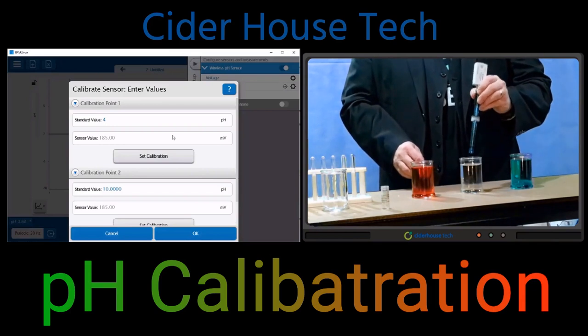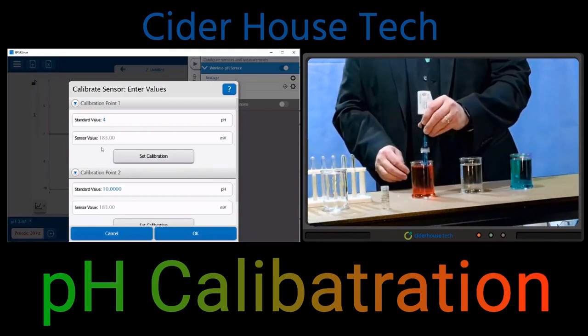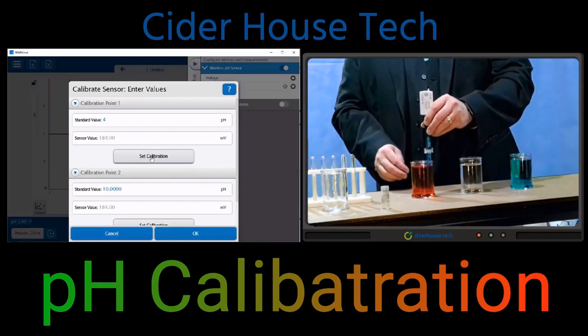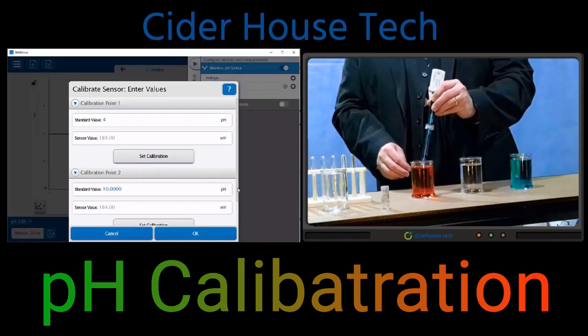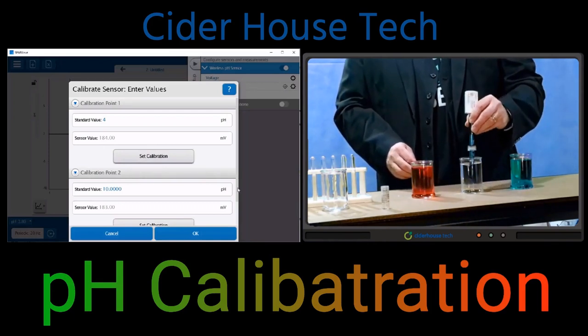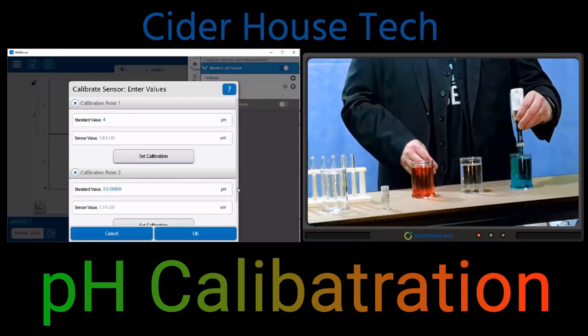Once it is immersed in the solution, I wait for it to stabilize. It looks like it's done that pretty much here. I'll go ahead and click on Set Calibration. Now I'm going to remove my electrode from my buffer solution and recap the solution so that it doesn't get spilled. Then I'm going to again rinse my pH electrode and blot dry so that I don't dilute my second pH solution with the deionized water.